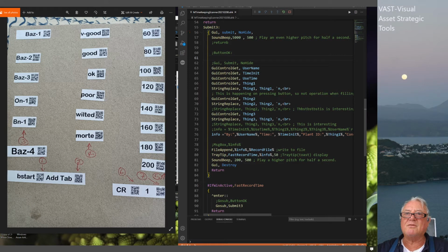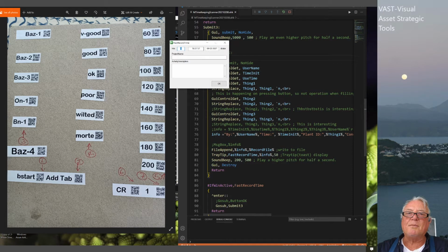But on the one that I started off with, once I put something in the first field, I tabbed across there, and then I tabbed across there. If I do another tab, it just sends me to the next input field, or it just carries on cycling all the way down, so it won't actually press the button. To do that, I have to reprogram with a carriage return and then send some input into it, and then it'll press the button if it's in the correct place. So that was a bit tedious.